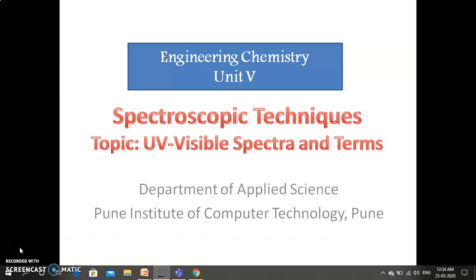Welcome. Here we are going to discuss UV visible spectra and the terms involved in UV visible spectroscopy. Before going to the UV visible spectra or terms involved in UV visible spectroscopy, we should have knowledge about UV visible spectroscopy, UV visible spectrophotometer, and theory of electronic transition.